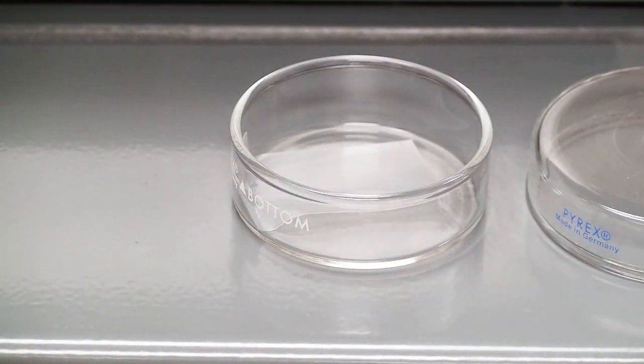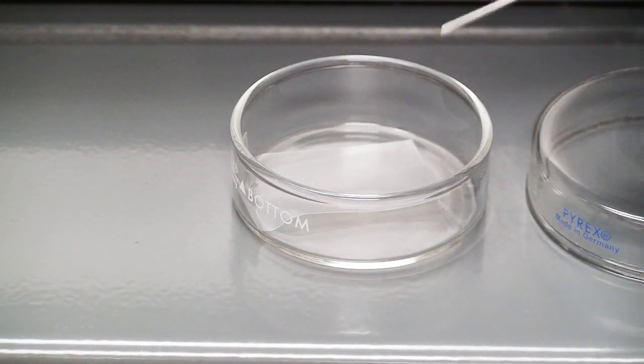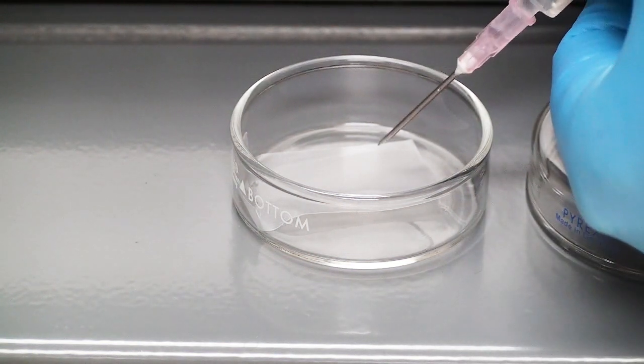Remember to float those on top. Don't drop your grid from on high, otherwise they could stain on both sides and you only want it to float on the section side down. Here I'm in front of the microwave, and you can see the parafilm in my petri dish.